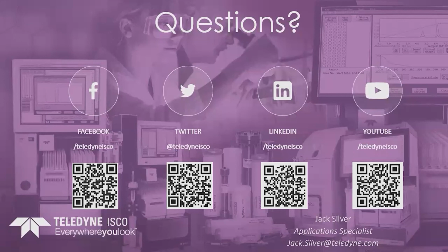There's someone who said CMW on TLC. I don't know what CMW is, so if you spell that out for me, I can help with that. Oh, never mind, I see it now. Can we separate the extract that shows separation on chloroform methanol water on CombiFlash? Okay, the answer is yes.